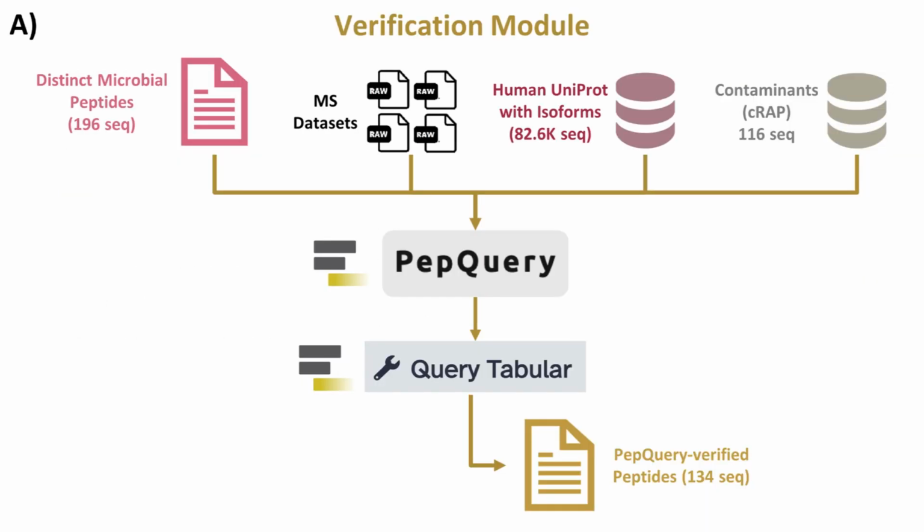Next, let's discuss how we are going to verify peptides in this module. Uniquely, Module 3 has been split into 2 figures, Part A and B, due to the numerous steps involved. In these figures, the major steps and tools have been depicted. I will give a general overview before delving deeper into what tools and outputs are involved. Details about tool parameters can be found on the GTN tutorial page.